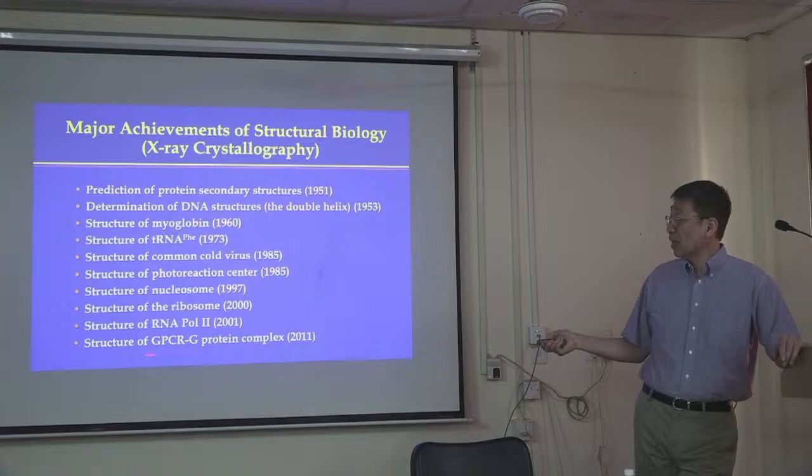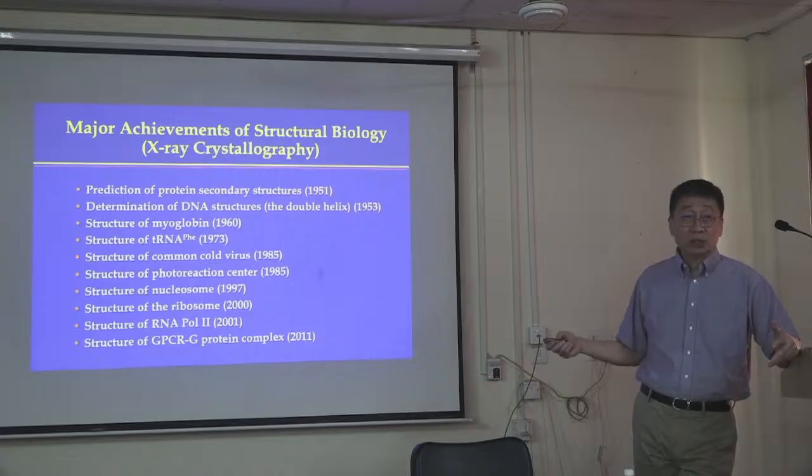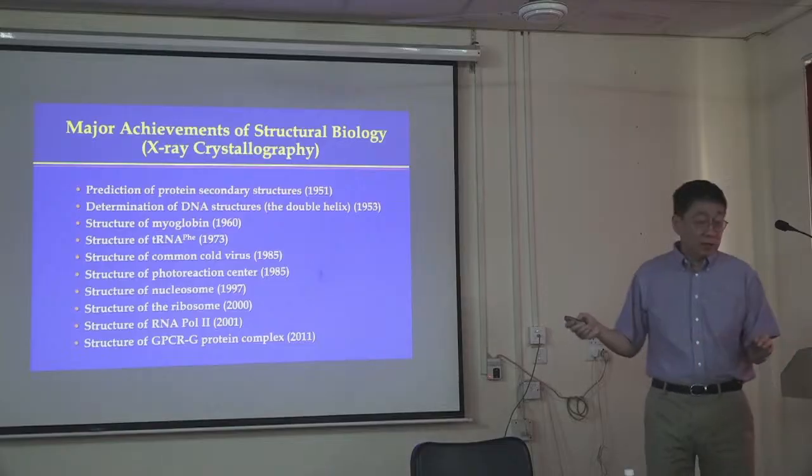And if I keep on going for the last 10 years or so, because of cryo-EM now, you get many more dramatic structures. For example, the spliceosome, the photoreaction center, or many other things that have been done by cryo-EM over the past 10 years or so, which I will not list here.